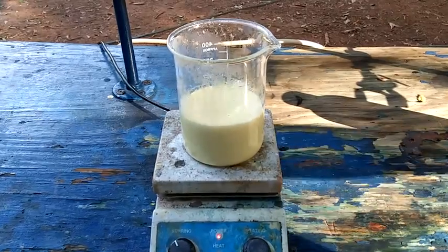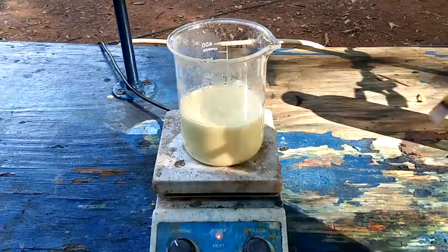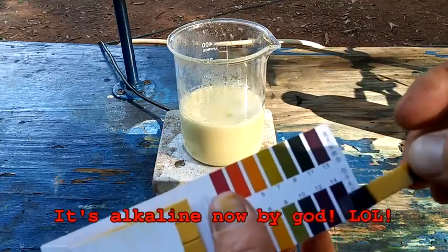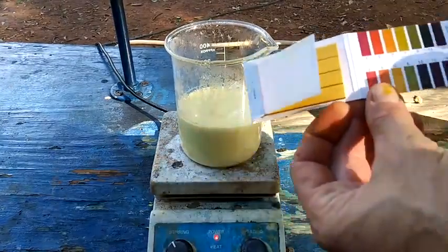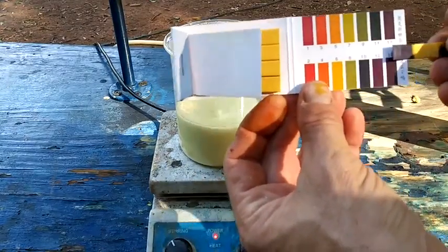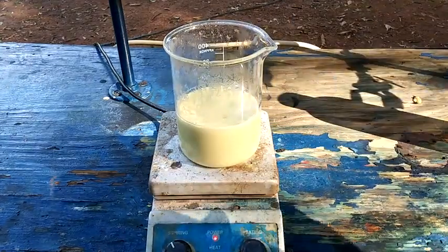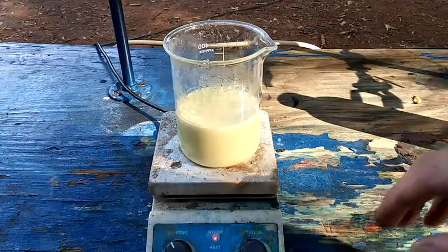Let's see what that's got us. Okay, there we go. That is like a pH of 14 or something. Oh, I don't know, can you see it better there? There we go. Yeah, it's somewhere around 11, or 12 rather. So it is very alkaline. So that's good, that's all we need.